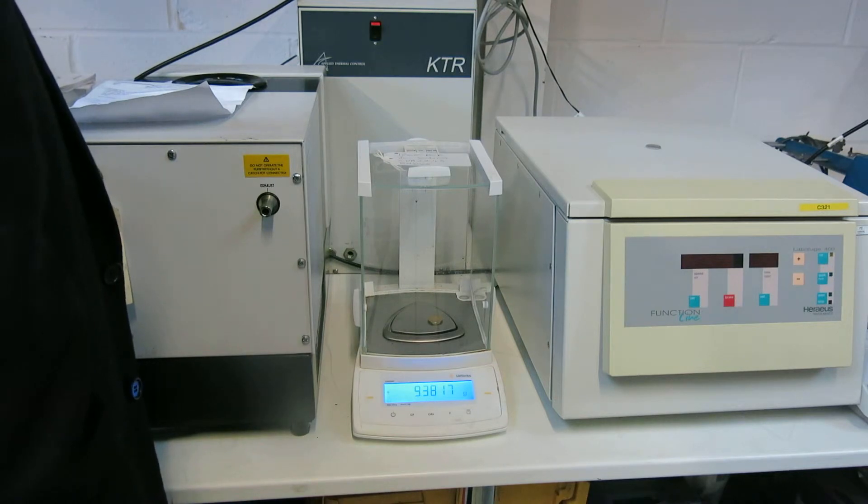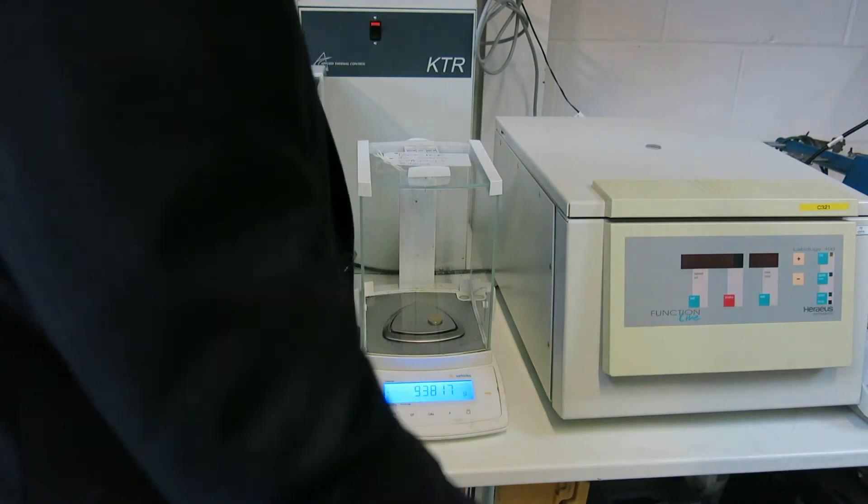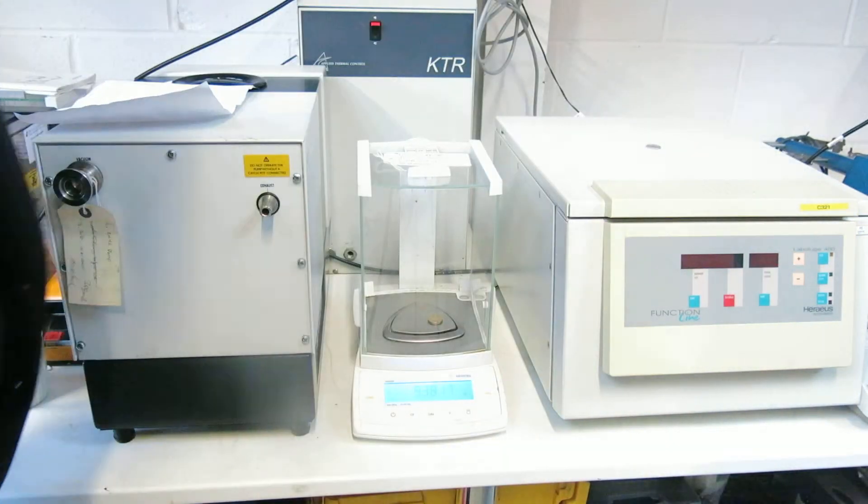So hopefully that gives you some sort of an idea of the repeatability of the Sartorius CPA 224S analytical balance. So Nick Edmund, Richmond Scientific, signing off. Thank you.